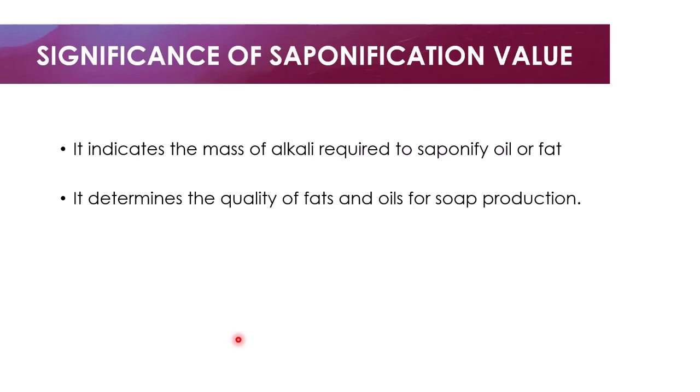4. Saponification value indicates the mass of alkali required to saponify oil or fat. And the last, saponification value determines the quality of fat and oil for soap production.